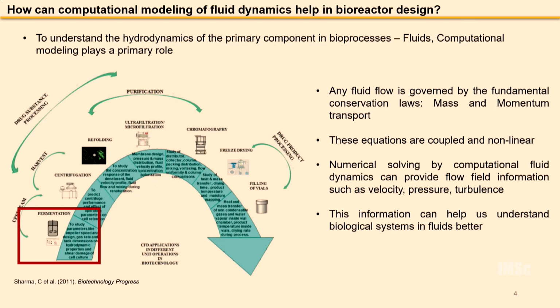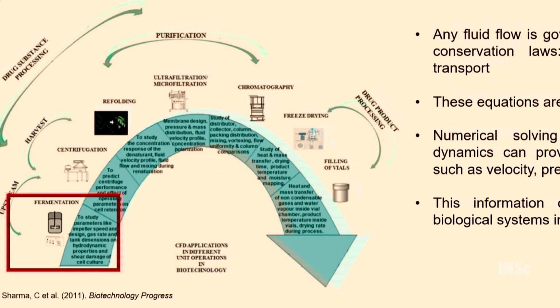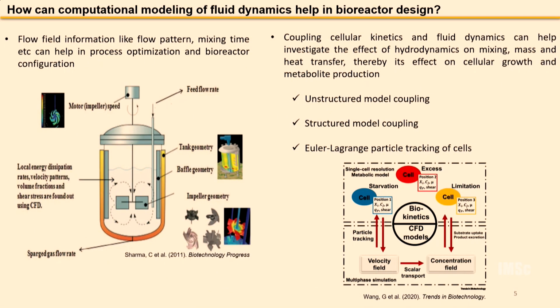So this information can actually help us understand the biological system better when we look into computational modeling. So here we can see there are a lot of applications for CFD in biotechnology, right from fermentation to the downstream processing, but I'll be focusing only on the fermentation aspect, which is bioreactor design.